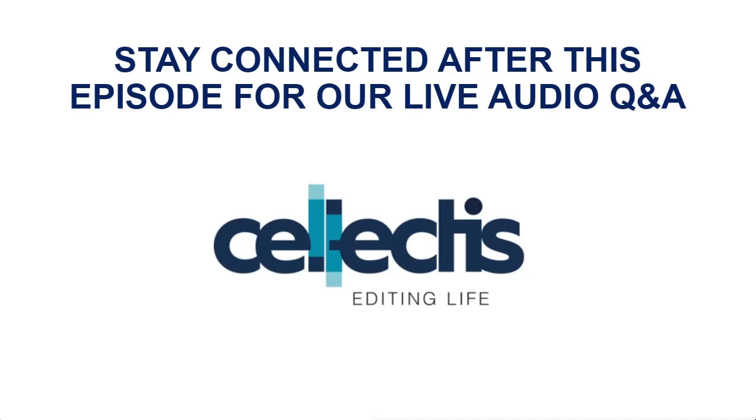Thank you, Simon. Thank you for the question. It's a good question because I think that this is a very differentiated competitive advantage that Cellectis has, electroporation. In September 2010, Cellectis purchased the assets of Cytopulse in Maryland, which was an electroporation company with a series of different devices. Since 2010, it's been 11 years we've been building up and improving these devices to fit our needs. The difference between an off-the-shelf electroporation device and having everything internalized will be very intimately described tomorrow at episode 4 by David Sourdive, the co-founder of the company, who has been working on this with a series of different devices that we've been building over these past 11 years.